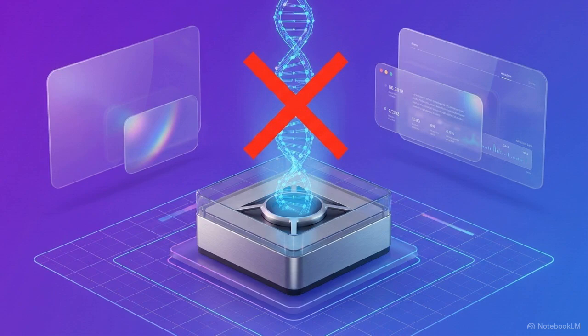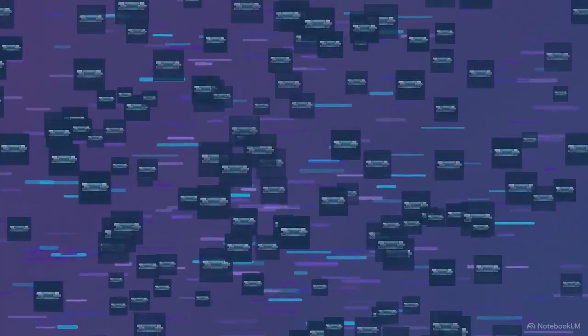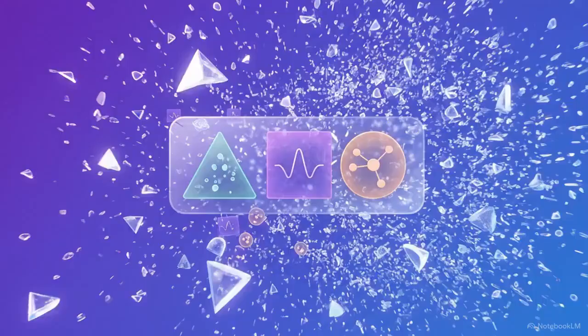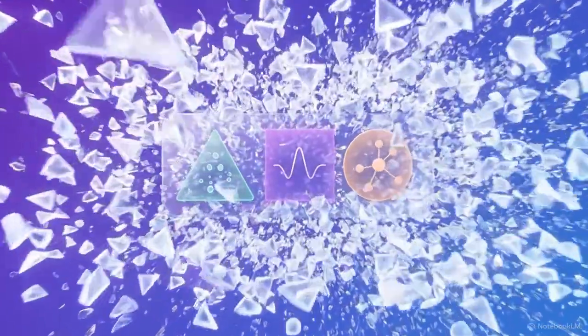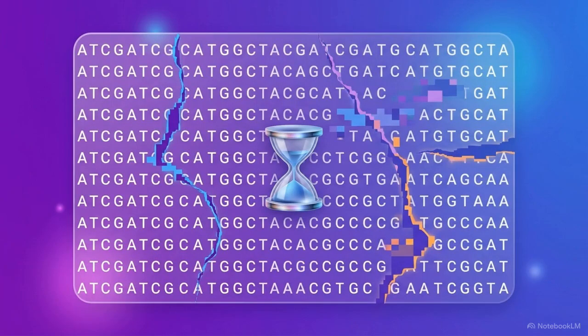When a sequencing machine reads a human genome, it doesn't produce one long, clean string of information. It generates hundreds of millions of short, overlapping reads, unstructured fragments scattered across a massive digital dump. These unorganized reads pile up into an astronomical file size, totaling over 100 gigabytes of raw data for a single person. If you try to open a 100 gigabyte file in a standard text editor, your computer will immediately freeze.